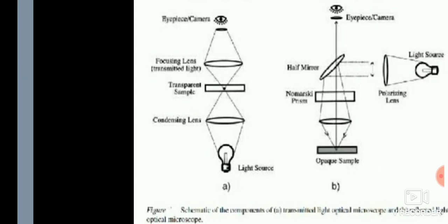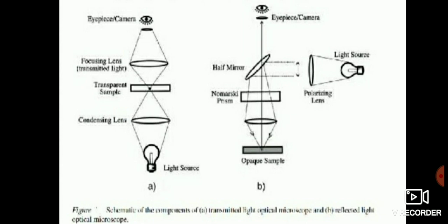This technique is useful for imaging a variety of reflective samples, including metals, semiconductors, glasses, polymers, and composites. The semiconductor industry relies heavily on reflective DIC imaging for quality assessment of computer chip components.